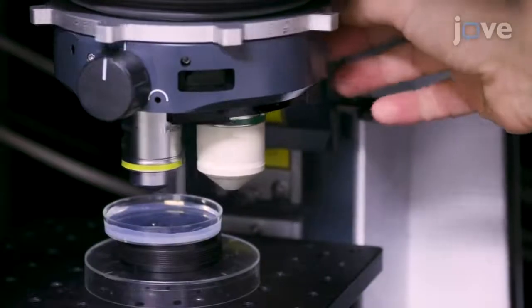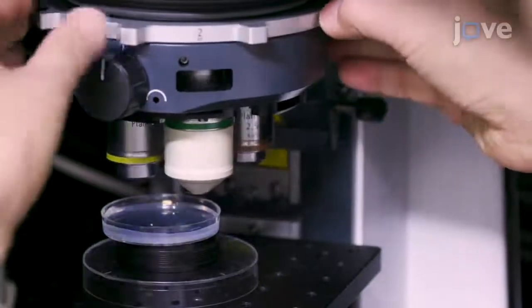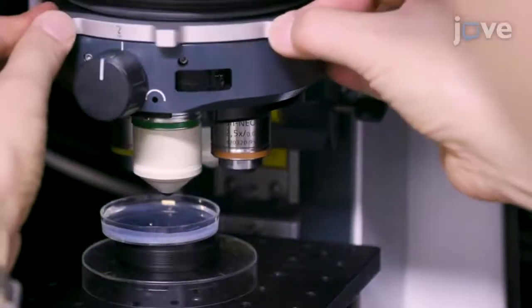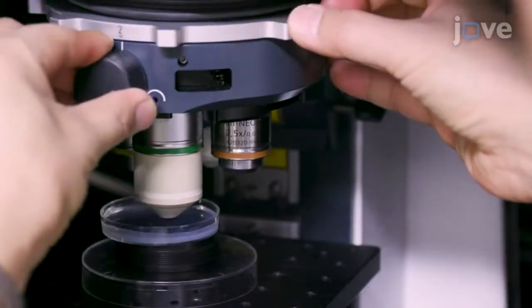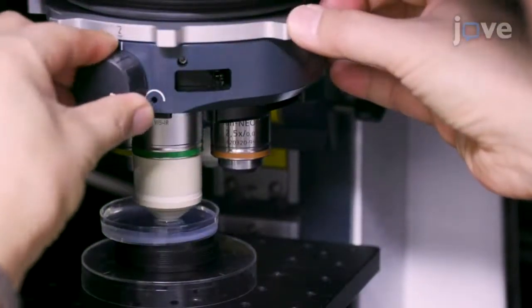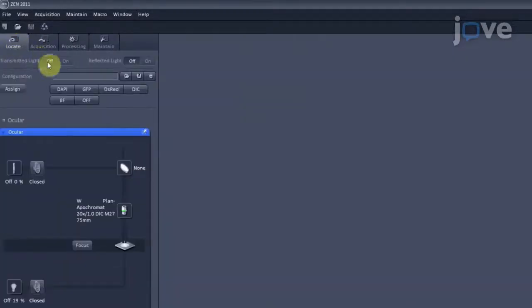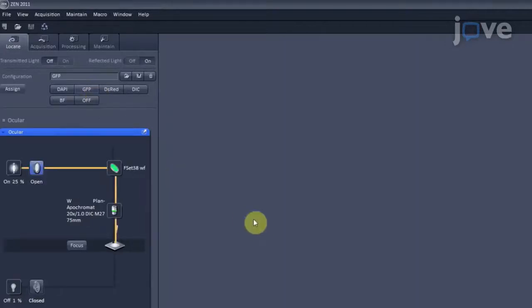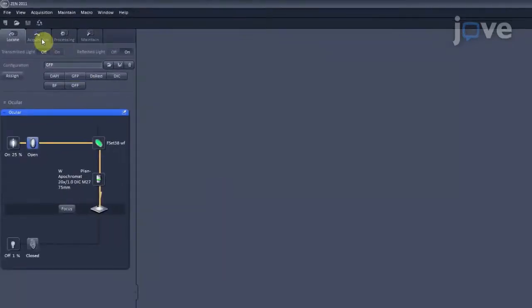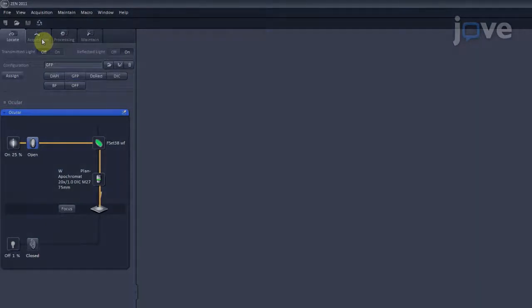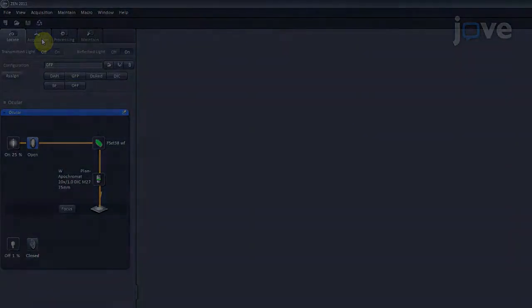Select the 20x objective lens by manually moving the lens revolver. Then click the Locate tab. Click GFP to change the optical pathways and directly view the fluorescence by eye. Center the zebrafish larval brain in the field of view, then click the Locate tab.